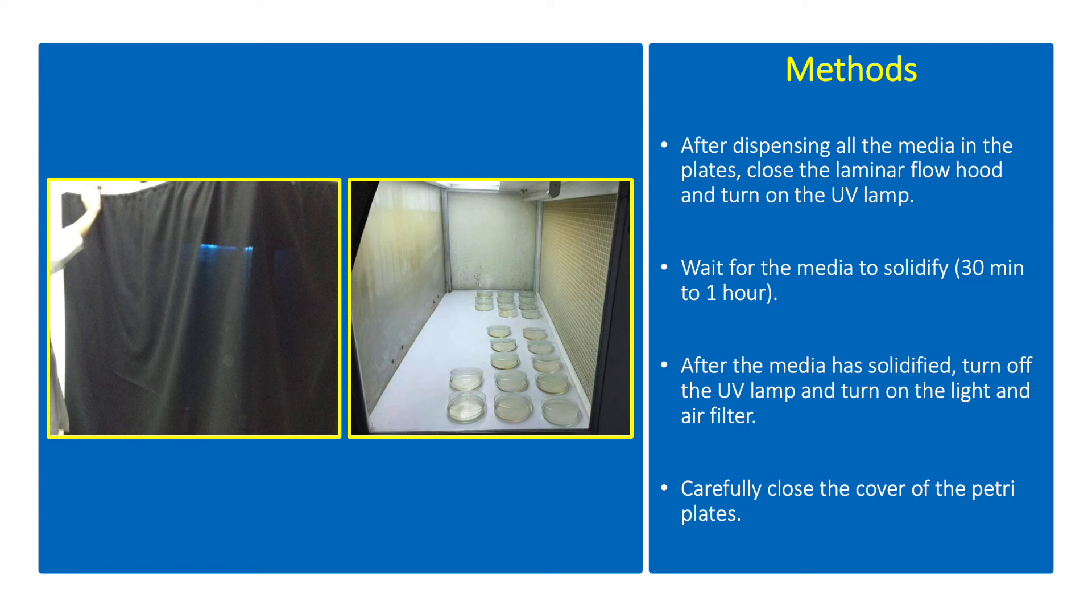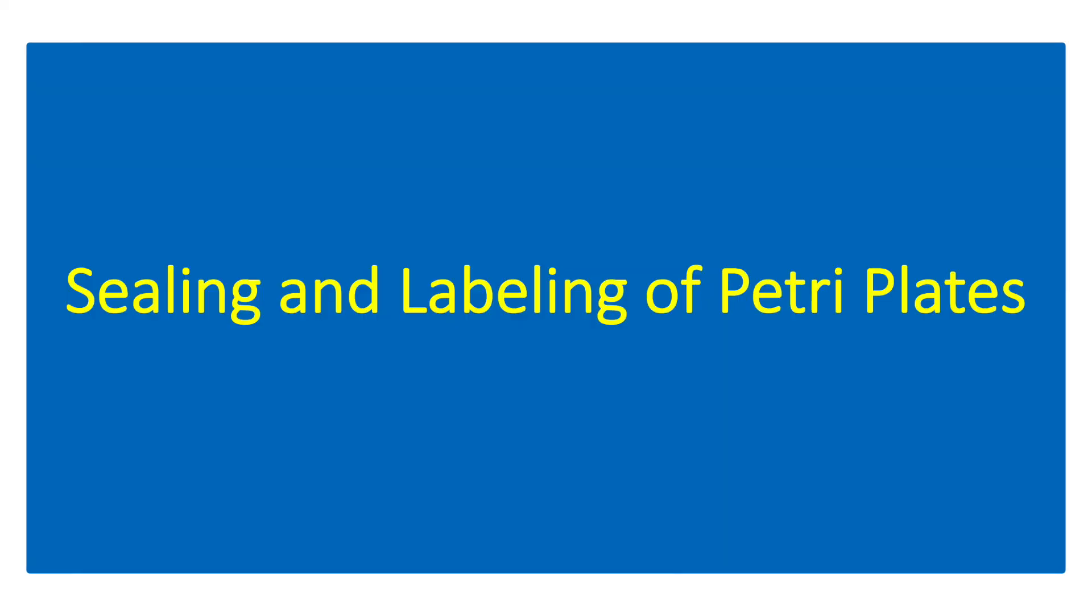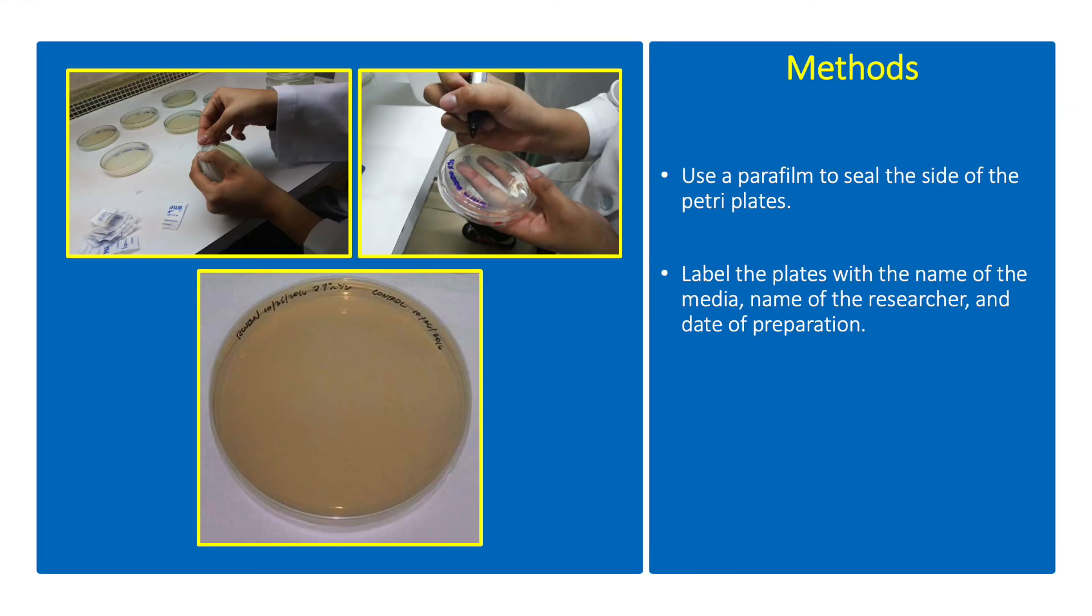After the media has solidified, turn off the UV lamp and turn on the light and air filter. Carefully close the cover of the petri plate. Use a parafilm to seal the side of the petri plates.